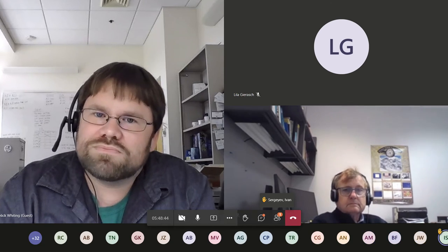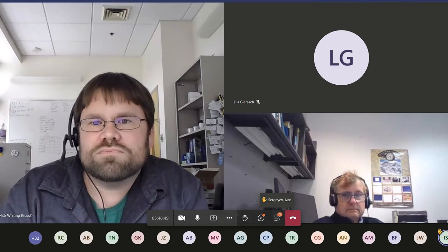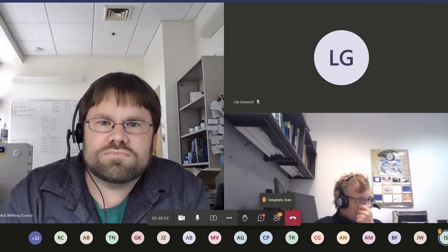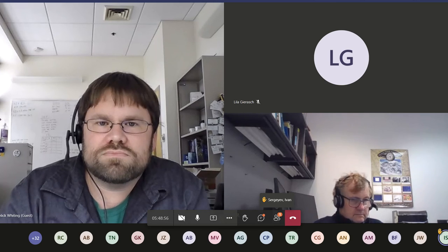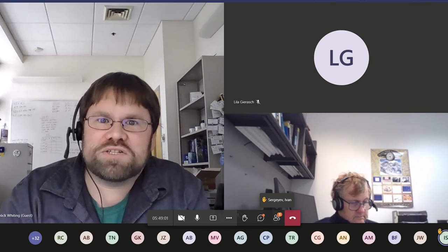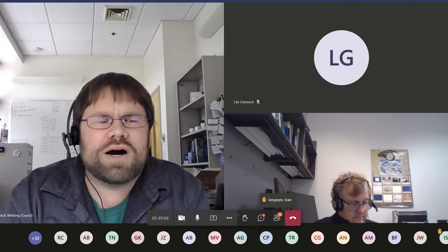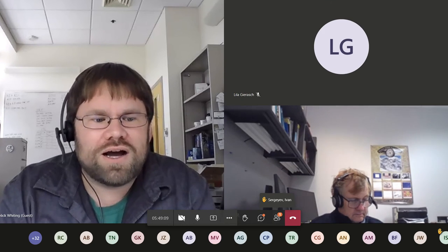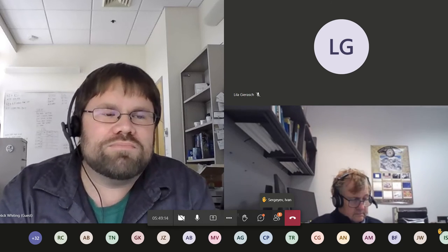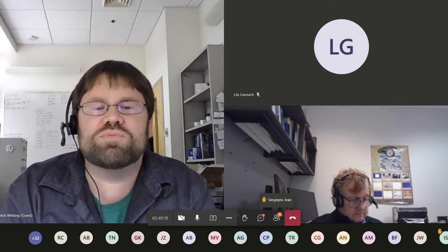Hi, Nick. Great talk. I've seen a lot of interest lately in hyperpolarized water, and I'm wondering if you can see any way of teaming up parahydrogen to make hyperpolarized water. Yes, people have done that. I think Russ Bauer's group down in Florida has been working on that recently, and my postdoc advisor, Prateep Bhattacharya at MD Anderson, before he moved to MD Anderson, he did a little bit of that as well. So yes, you can use parahydrogen to polarize water.